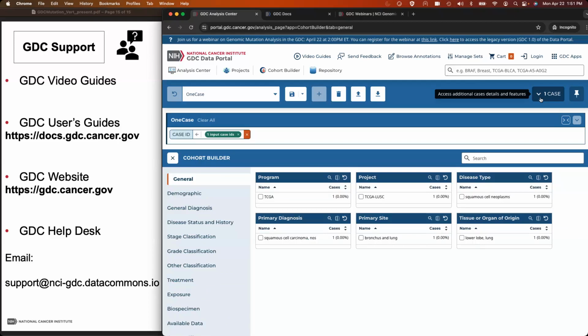So it wouldn't be visualized as like a time point or anything. But if you were to have multiple variant calls at different time points, that is definitely something you would be able to see if you were looking at the somatic mutations.